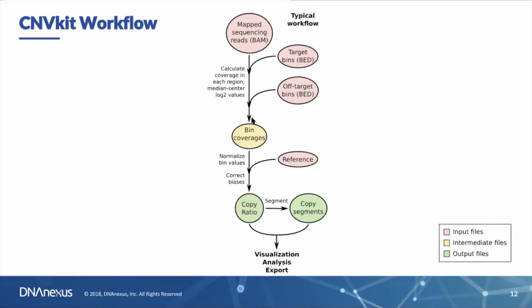And then you have your coverages within each bin, either on-target bins, which are basically just exons, sometimes subdivided for consistency for large exons or targeted introns, and then your off-target bins, the uncaptured regions, which have already been subdivided into roughly equal-sized regions. So there you have coverage depths within each bin. We apply a few normalization steps, which I'll get to possibly a little bit later. Then do further normalization to a reference copy number profile, which I'll discuss in just a second.